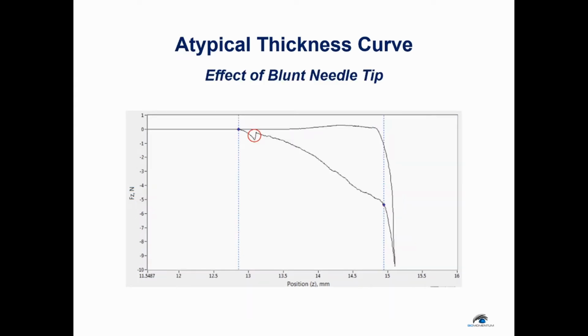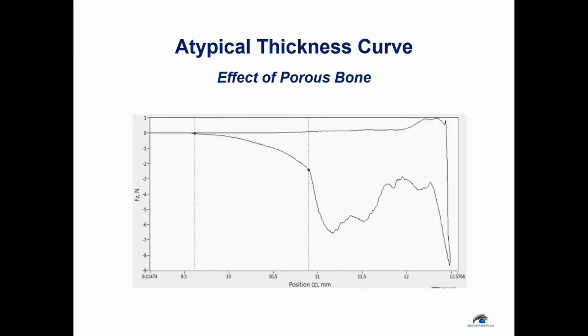If using the same needle for the entire articular surface, the needle tip is likely to become blunt over time. When this happens, it may not be sharp enough to pierce the cartilage at point of contact. This results in an increase in force followed by a quick decrease when the needle eventually perforates the cartilage. This produces an artifact shown in the region with the red circle and should not be included in the analysis. For this type of curve, the correct point of contact with bone corresponds to the inflection point associated with the sharp increase in the absolute value of the force with no immediate decrease.